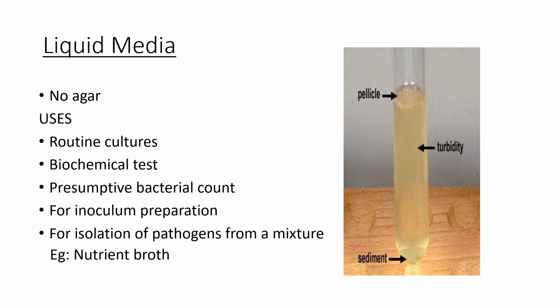So now the next question is, what is the pellicle? Pellicle implies the multifaceted response to the changing environment which is induced by the bacterial growth, and it is formed between the air and the liquid interface of the standing liquid media. That means air and the liquid interface जो होता है, that means at the top of the media, इसके ऊपर आपका pellicle formation होता है.